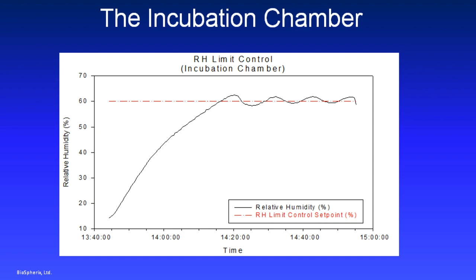But if you put a ton of water into an incubator, say if you fill up that tray that's in the bottom of the incubator, that Xvivo will be fighting it the whole way to keep it down under the limit control. And it will fight it until it runs out of gas. And then the filters will get saturated with water and the sensors won't be able to read properly anymore because the RH has gone too high. So you don't want to set up that battle in there. You don't want to saturate those sensors.